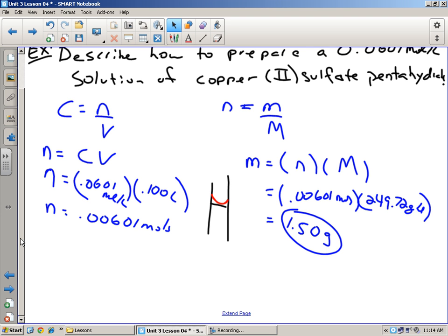Standard solutions. So, a couple things you need to write down probably, because I noticed you guys didn't write anything down. Make sure. It's up to you what you want to use, but I use a 50 milliliter beaker. You're going to put it on the scale, and you're going to tare it, basically put it back to 0. So a 50 milliliter beaker works fine. If you want to use a weigh boat, that's your choice. If you're going to use a weigh boat, you have to do the same stuff.